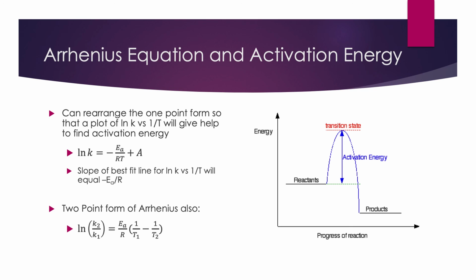But as you're going through the lab, do try hard to think about, for each of the parts of the lab, what we're really focusing on information-wise from a kinetic standpoint, but also from the Excel side, hopefully learning how to use Excel a little bit better to make it easier to do calculations, because Excel is a really powerful tool. Last week's final plot, the concentration versus time plot, should have given some introduction to those things. We'll be walking you through some of those a little bit better this week too, and hopefully that will help you before that Beer's Law plot is due. So if you haven't figured that out quite yet, what you see in lab this week will hopefully help with that and make that process a little bit easier.